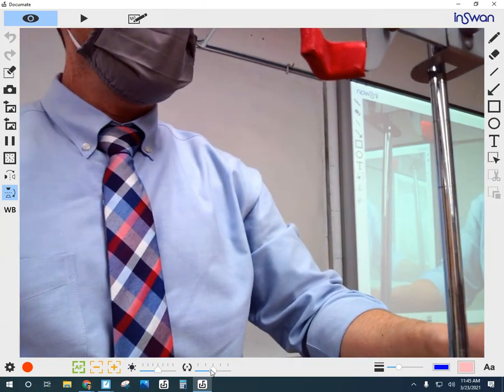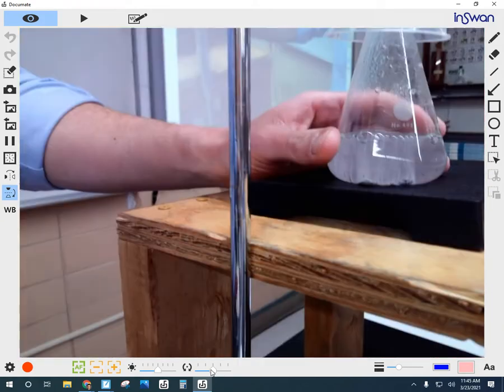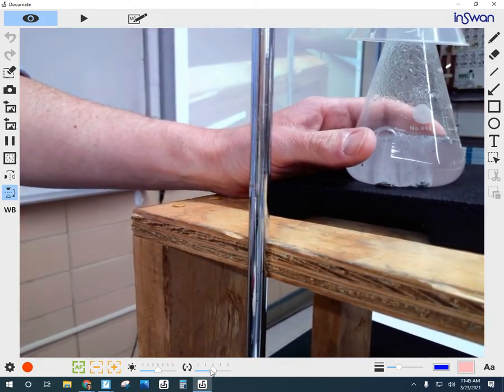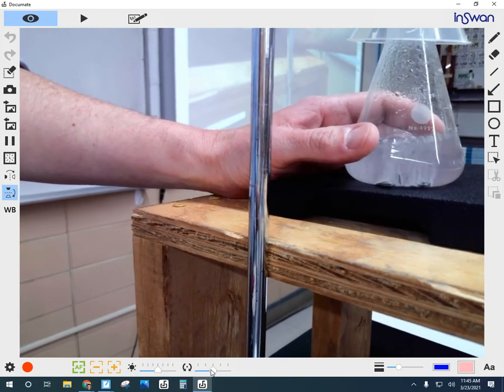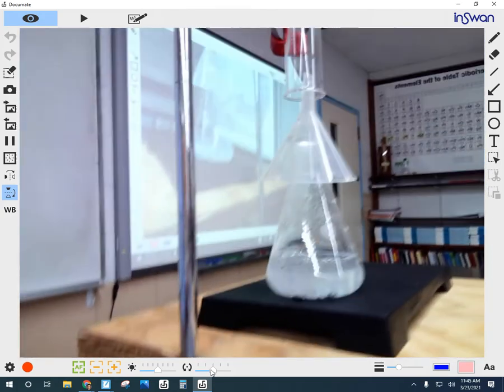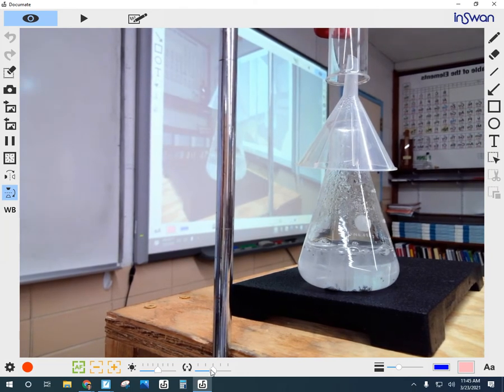And as a little side note, I can feel that the flask is warm, right? This is an exothermic reaction. It's not as exothermic as the lithium water reaction that also makes hydrogen, but I can tell there's definitely some chemical change going on here, and it is releasing some energy. So I'm going to go ahead and let that sit for about 5 minutes. Get my timer going on my watch.